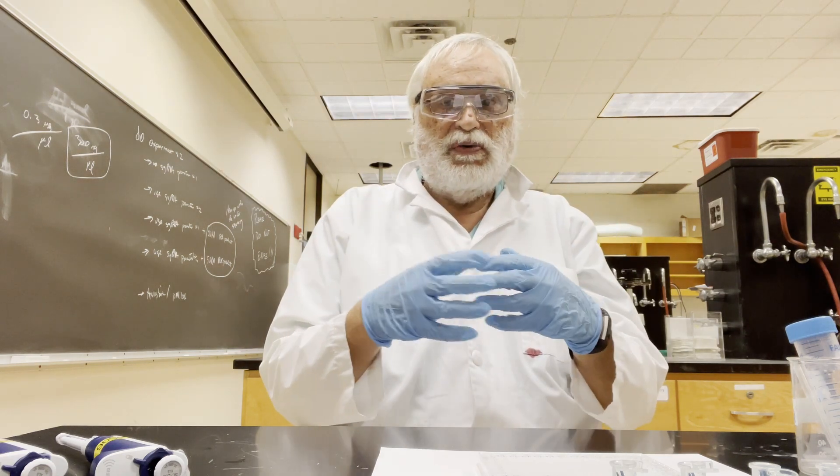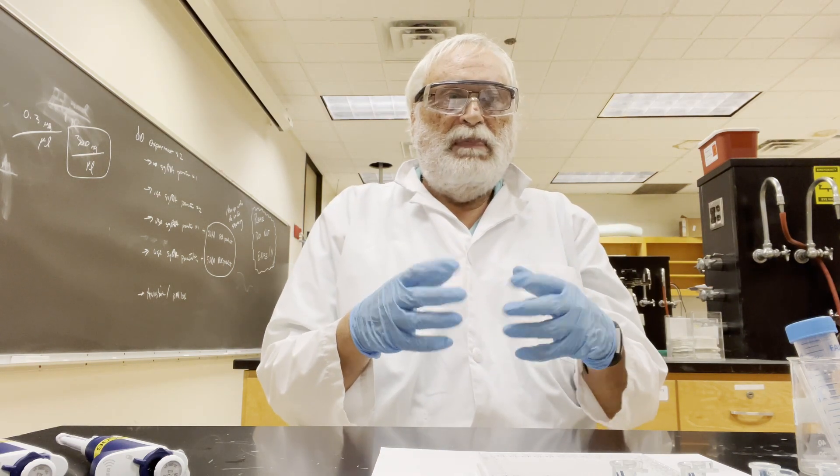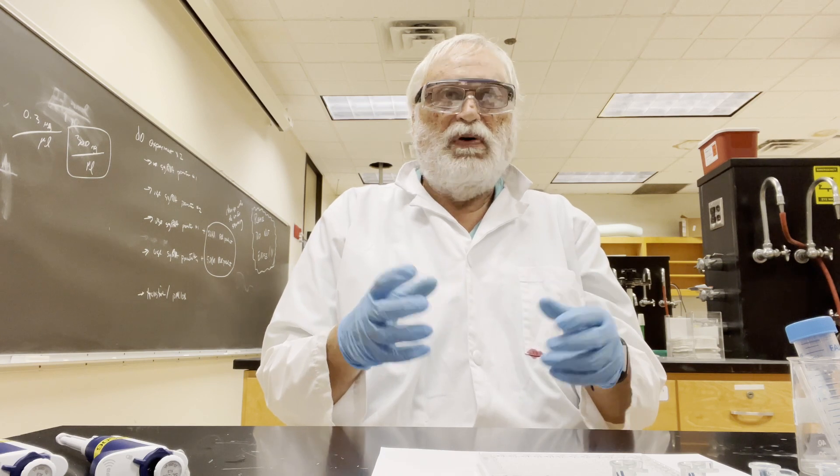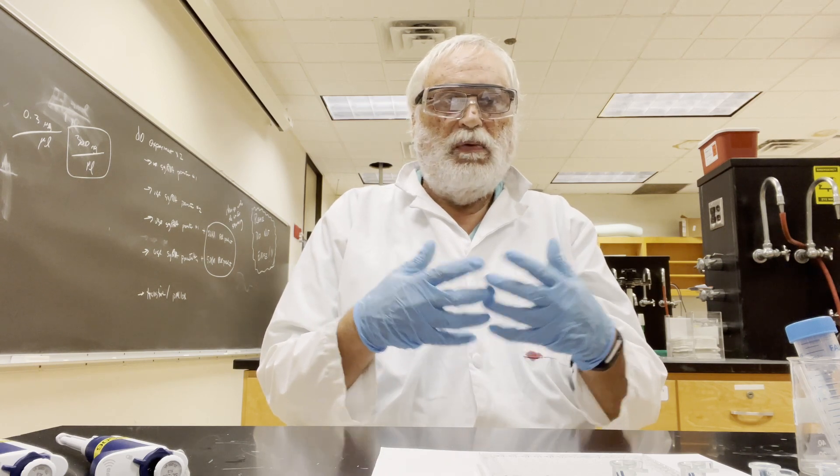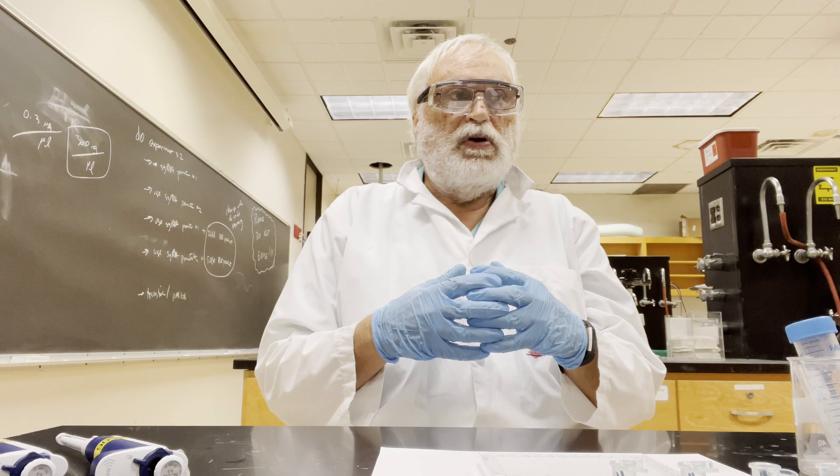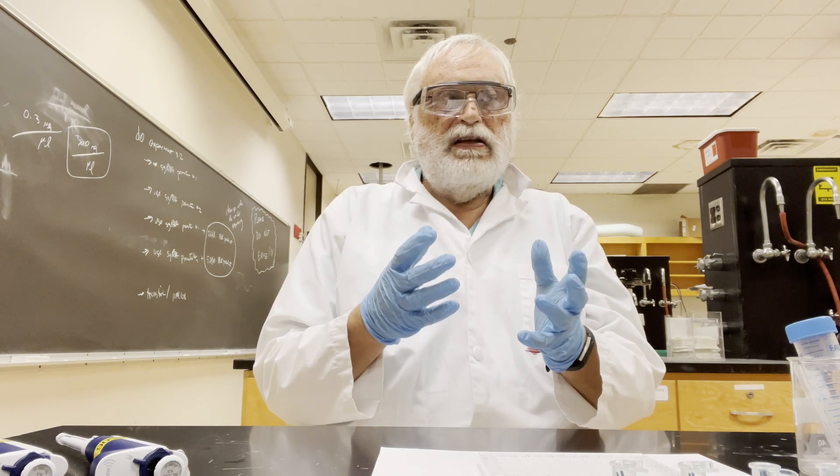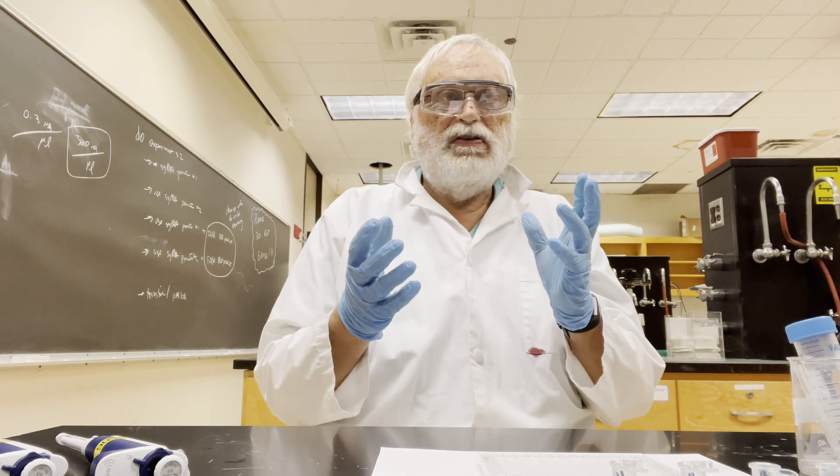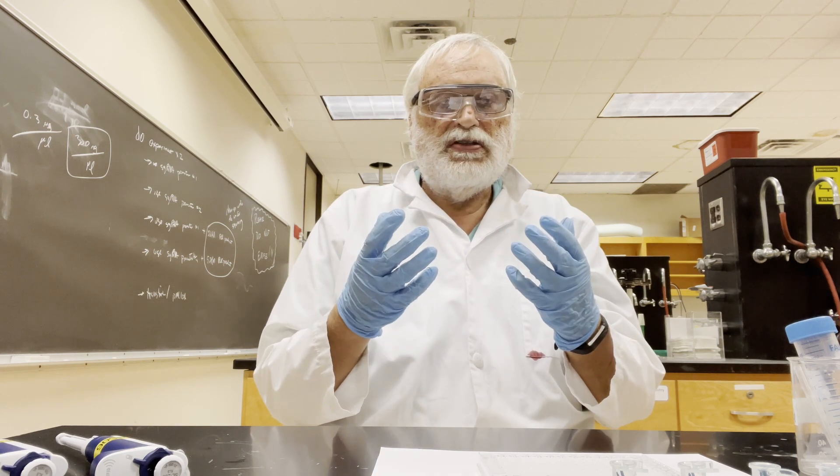The scientific protocols frequently are a little bit difficult for people to start reading initially, but once you are used to using them they work out very well. So we're going to generate a little video. This video is going to talk about doing serial dilutions.